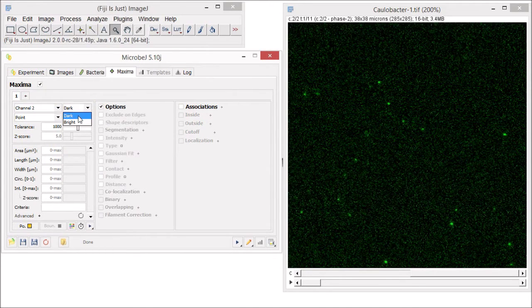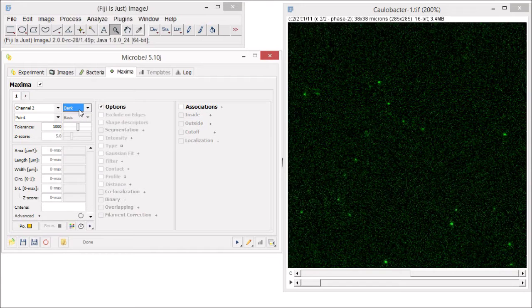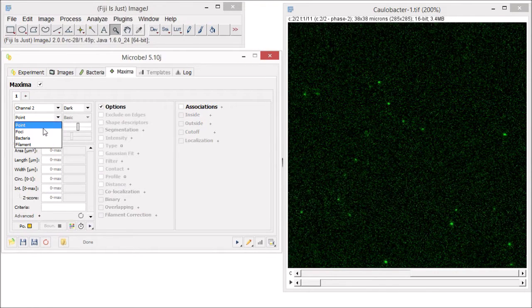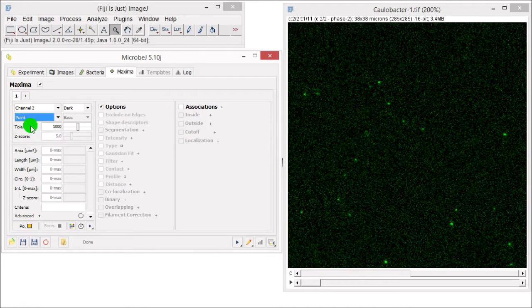Now select the type of background. The images in channel 2 have a dark background compared to the fluorescent particles that we want to detect, so we will use dark mode. Below this, in the mode of detection drop-down menu, there are several choices available. For details about all the maxima detection modes, please refer to the documentation on our website.